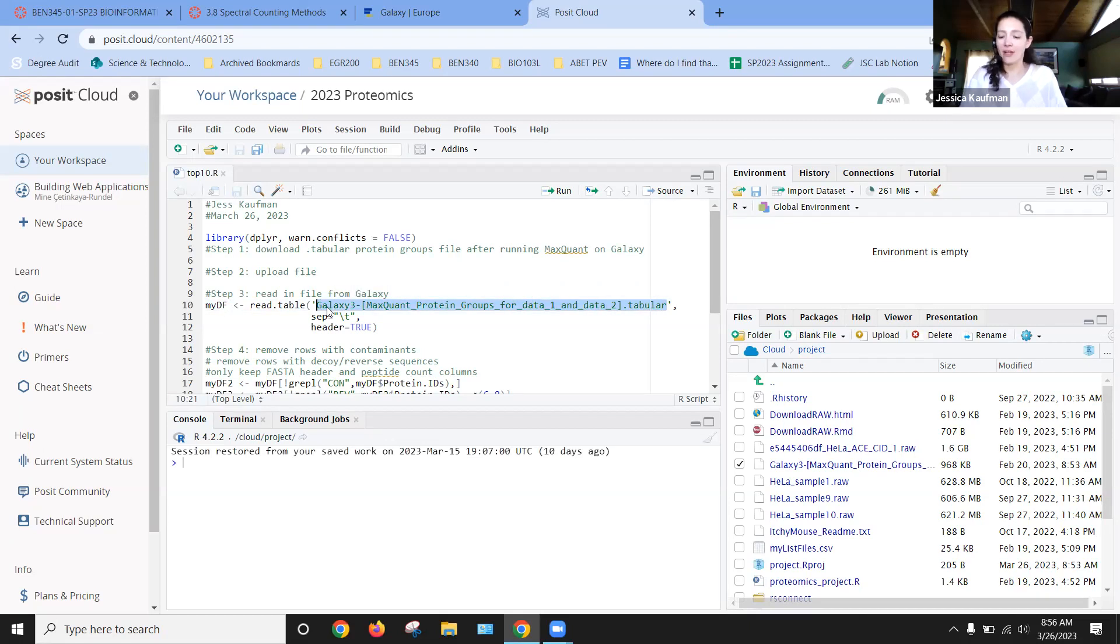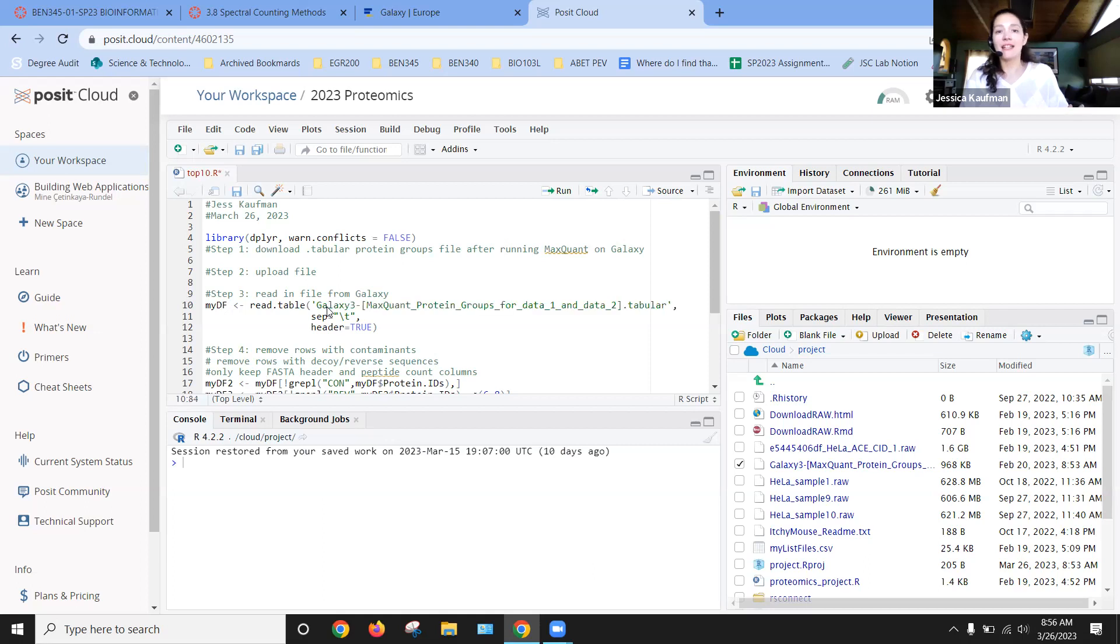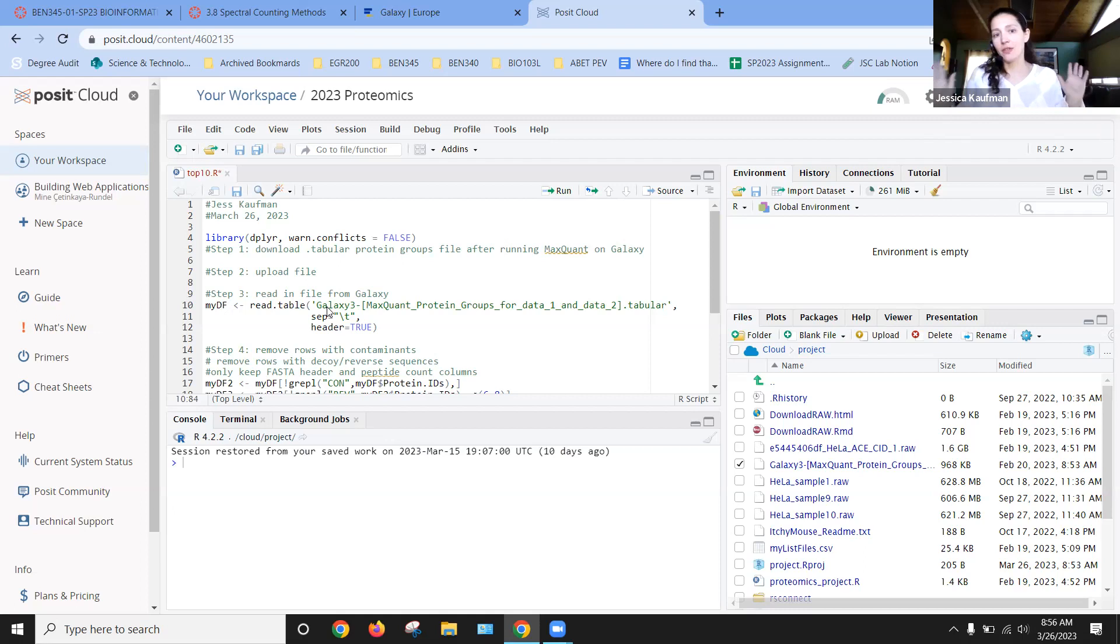When we have a command like read.table, we have to specify the file name in quotes. If we put the quotes and start typing the name, we can then hit tab to complete the name. That works just as well as renaming it, so that's what I chose to do.